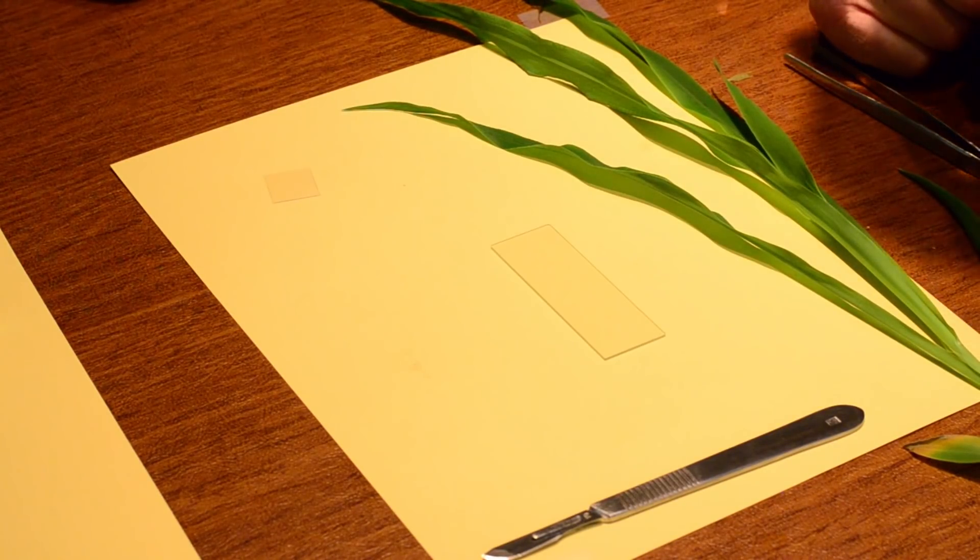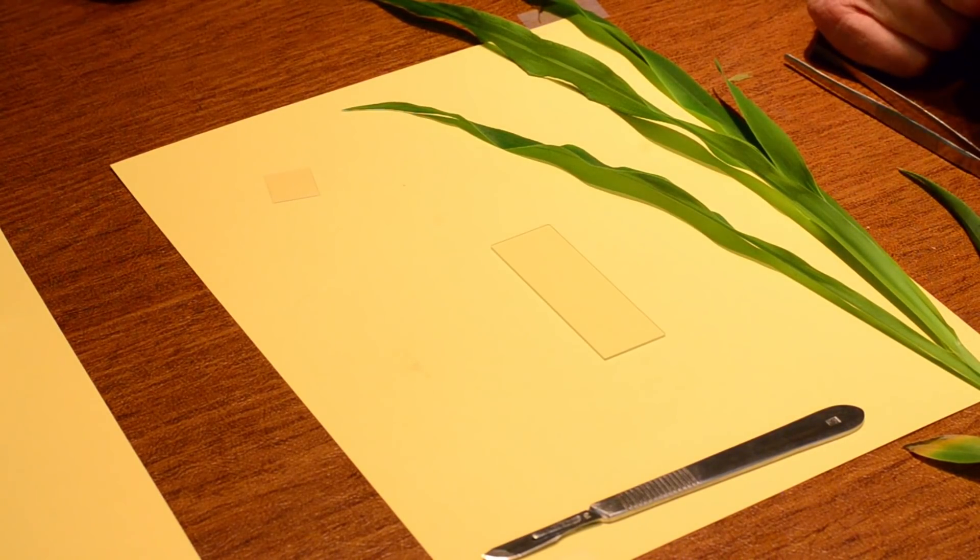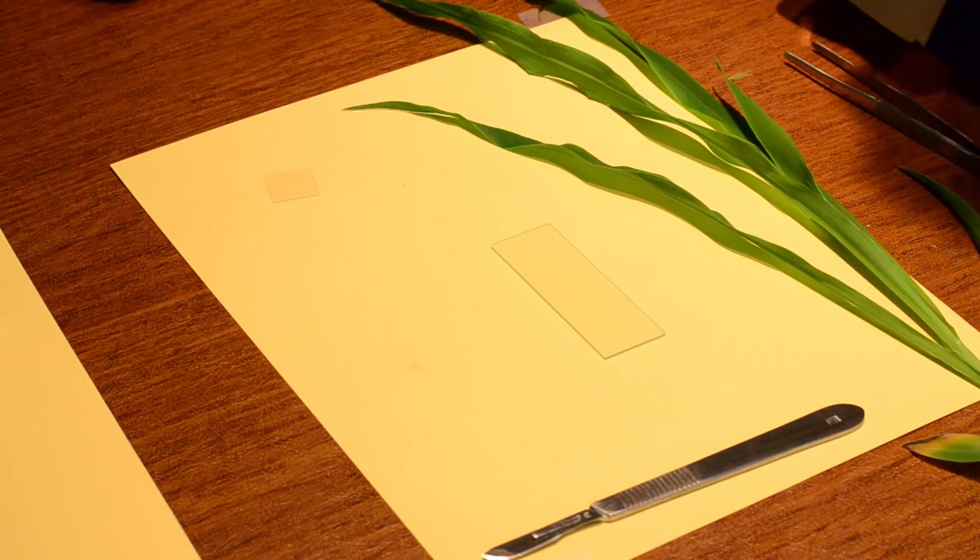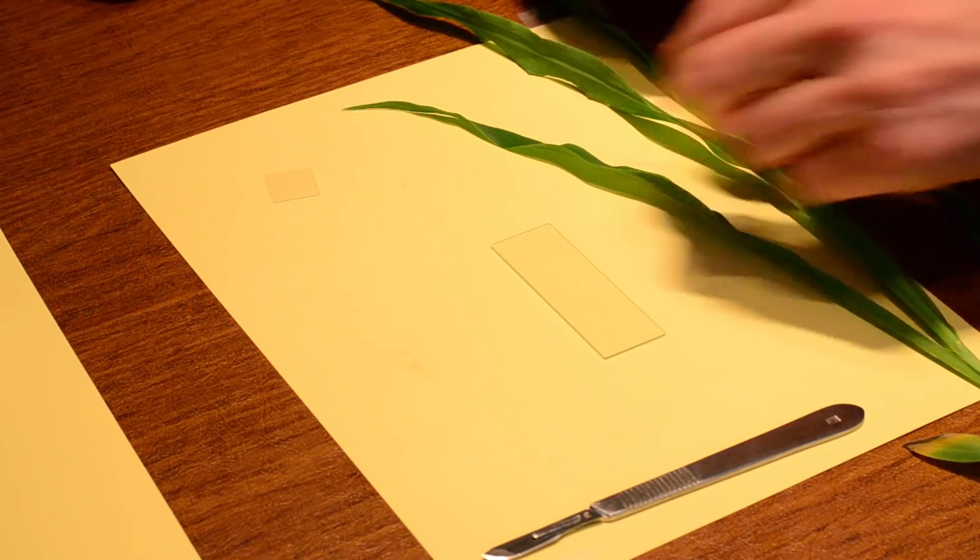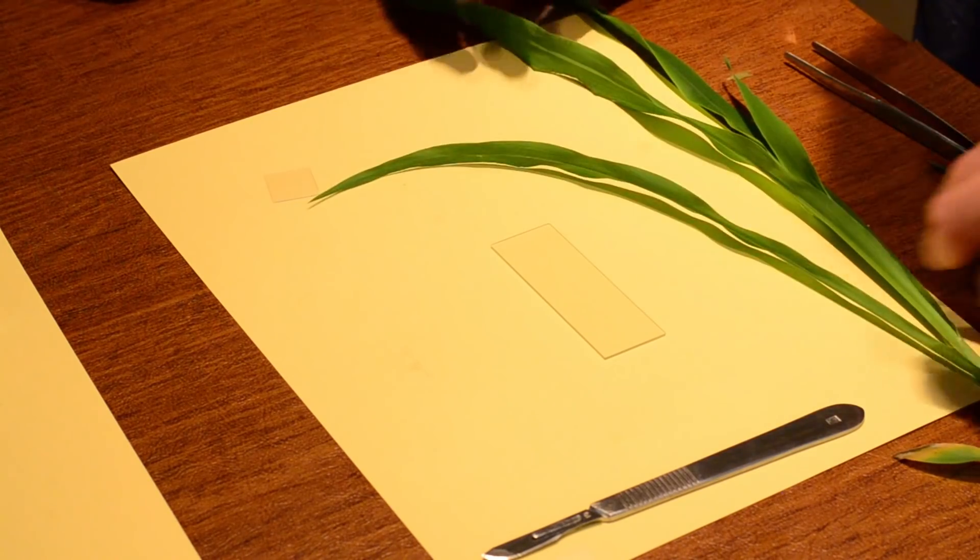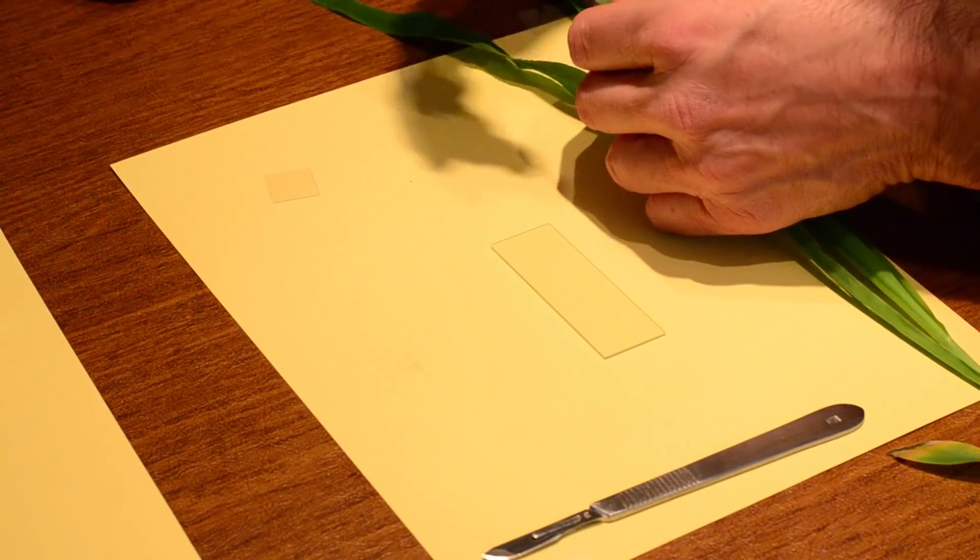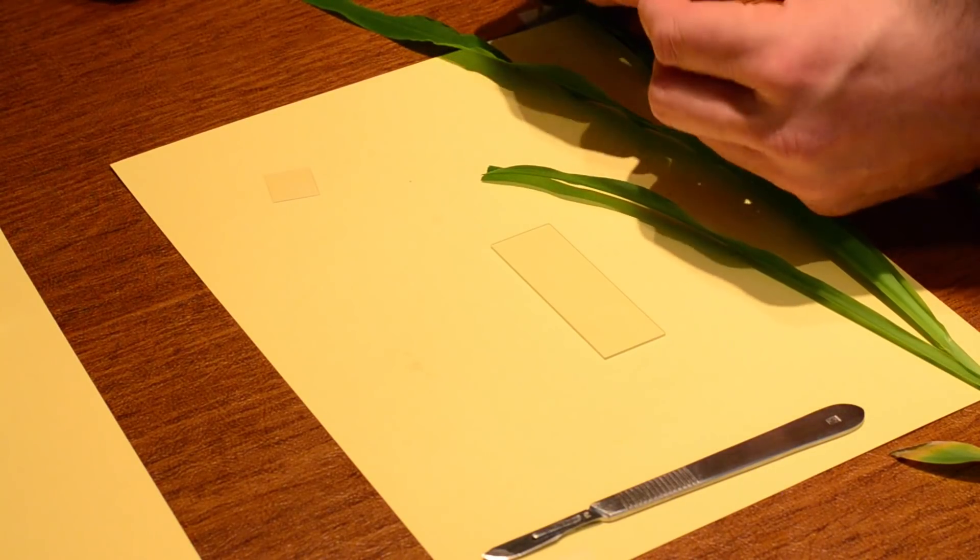Okay, the last one we're going to do is looking at the stomata. And these are the little tiny openings. They look like lips actually on the underside of the leaf. So we want to get the grass, the monocot, the corn. And we just want a little piece of the leaf. So I can just rip that with my fingers.